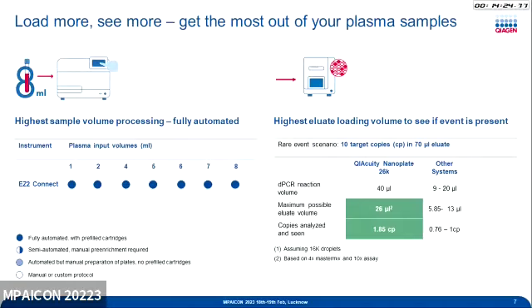Second thing, in digital PCR, you can see we can put reaction volume up to 40 microliter. The benefit of increasing reaction volume is that if you have very low target, you can still see more than one copy in the reaction chamber. On other platforms the reaction volume is low, suppose 20, so you are actually putting only 5 to 10 microliter of DNA.